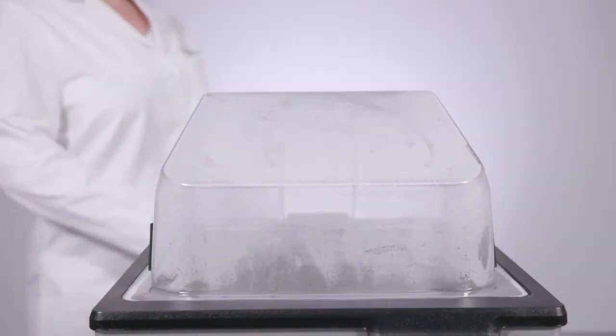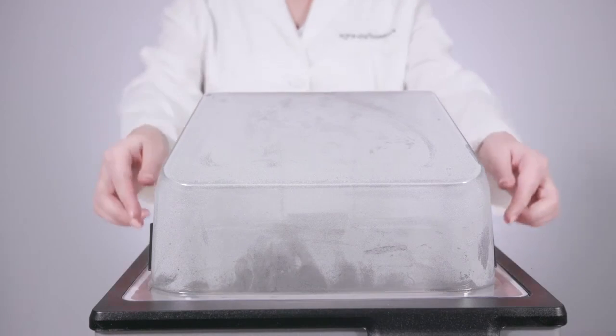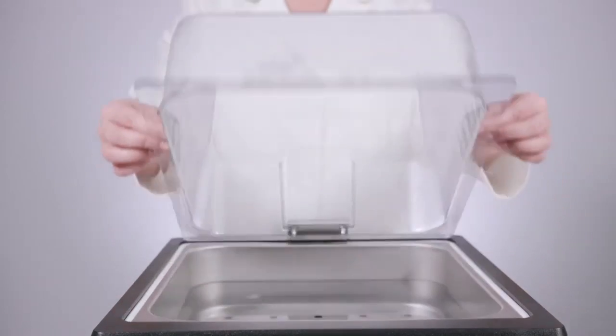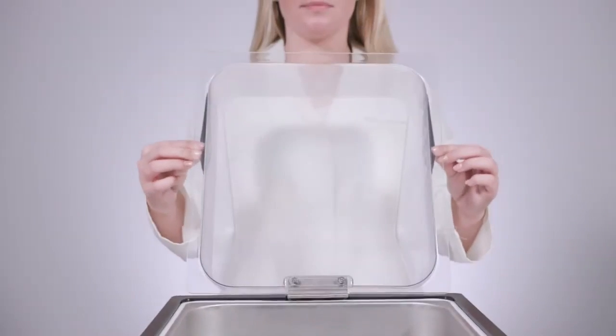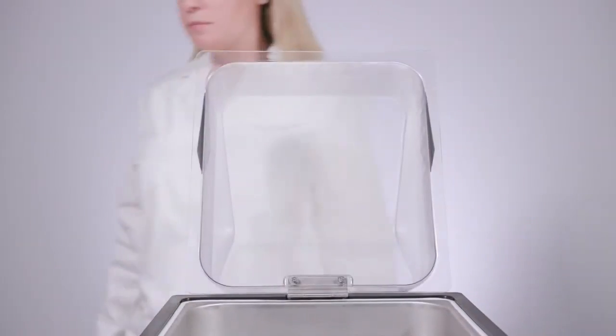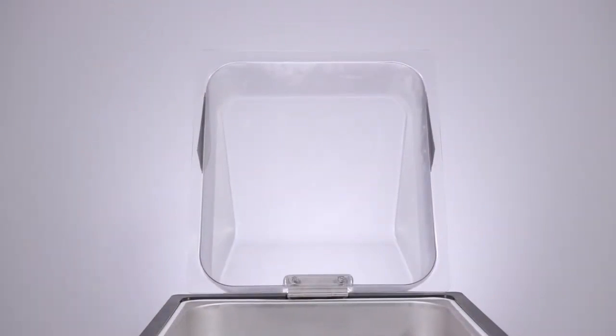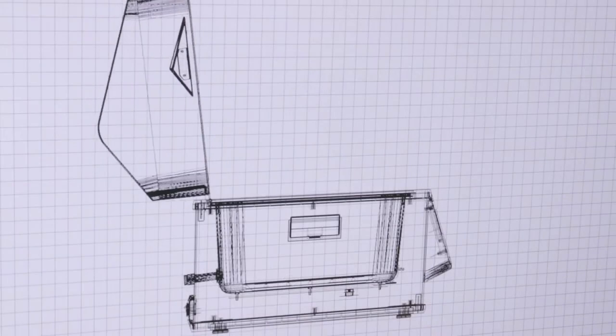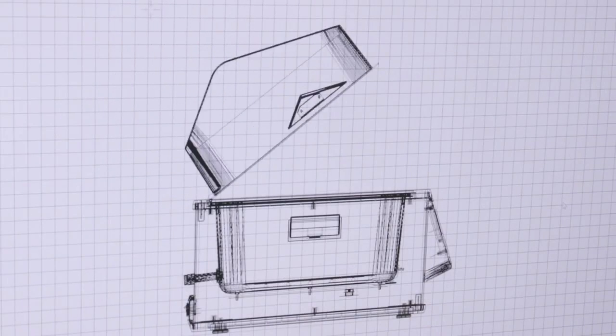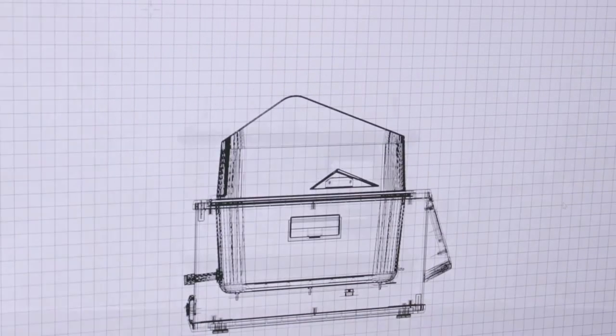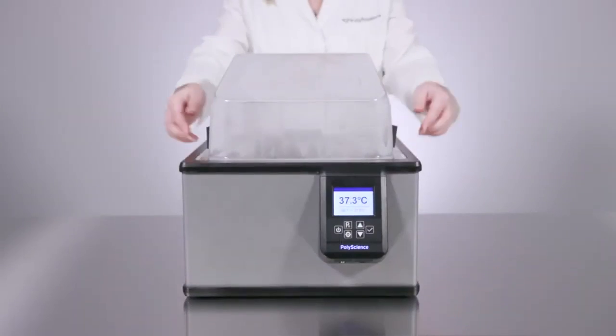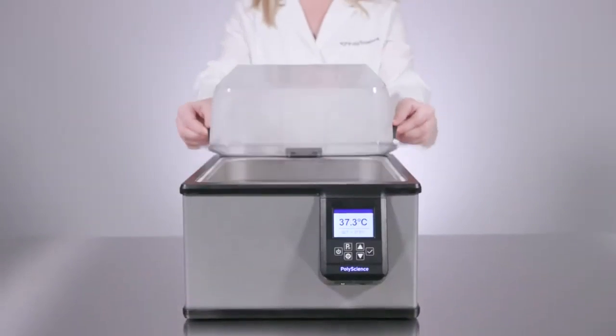PolyScience was the first company to put a clear hinged gable cover on a water bath and this continues to be a standard feature on all of our water baths.